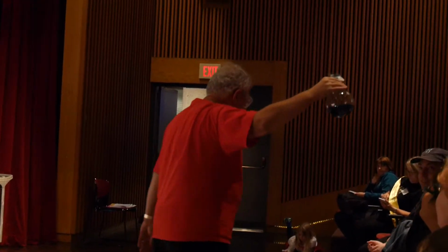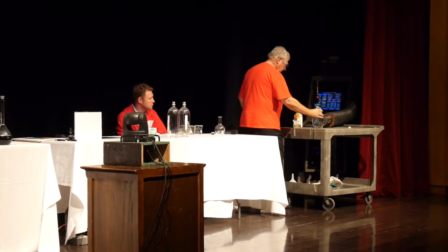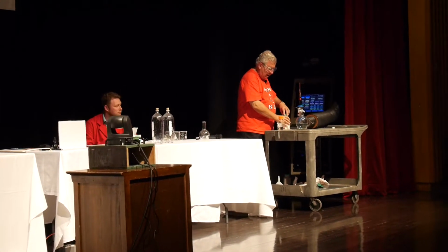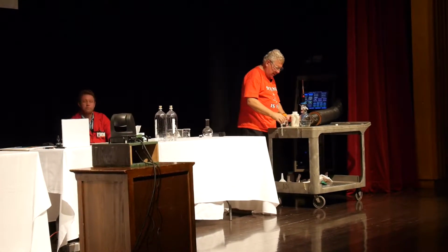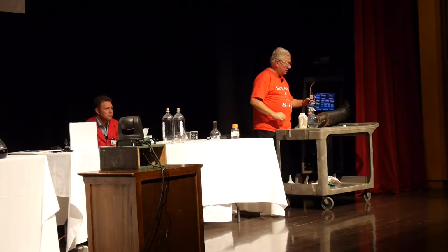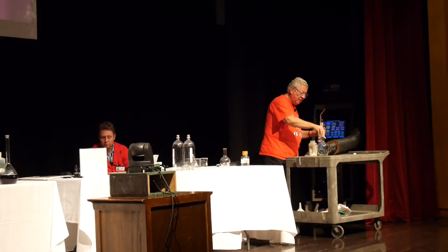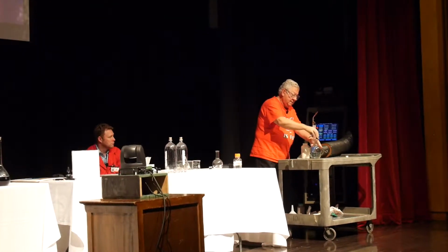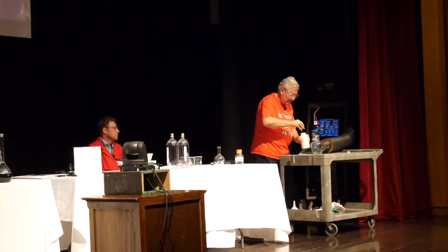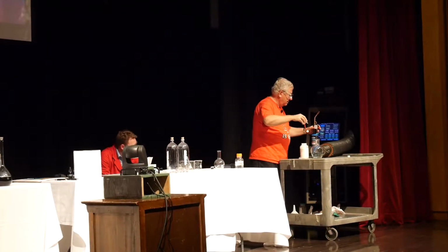All right. So what I'm going to do now is carry out an experiment using the element sulfur. Sulfur is a solid at room temperature. I'm going to take some sulfur and I'm going to burn the sulfur using the torch that I have over here. So that's what this is for. I'm going to scoop some sulfur. Can you see the color of sulfur now? Yeah, it's yellow, right? Now I'm going to burn it.